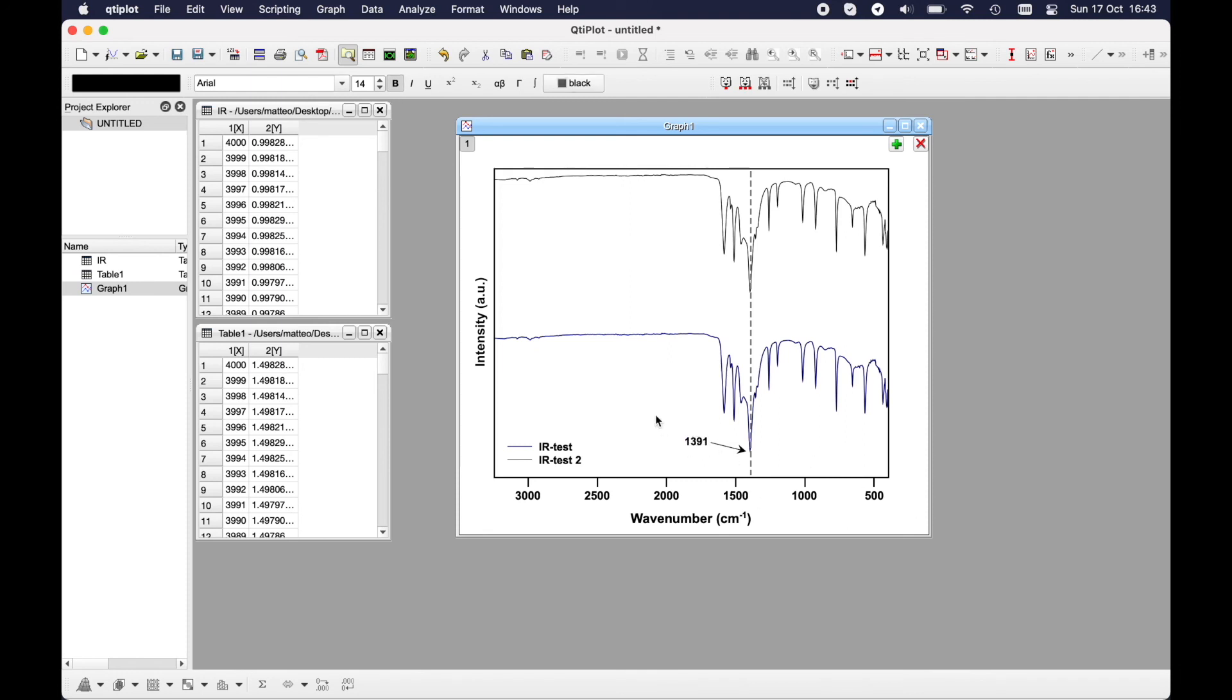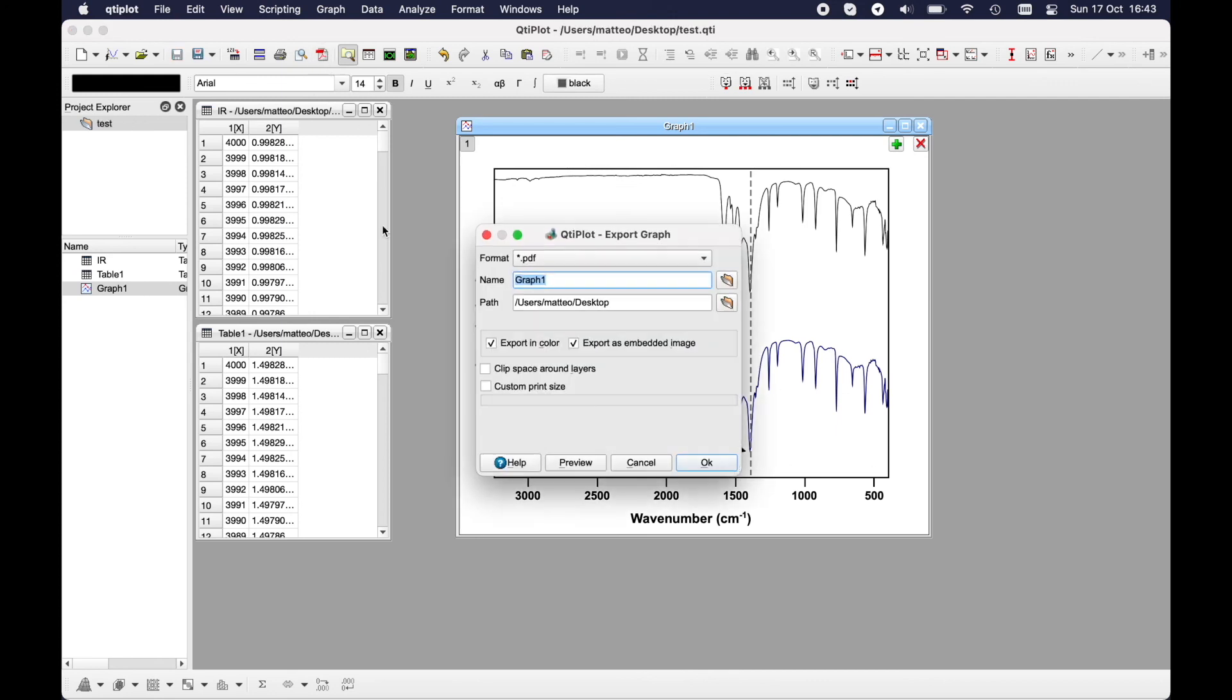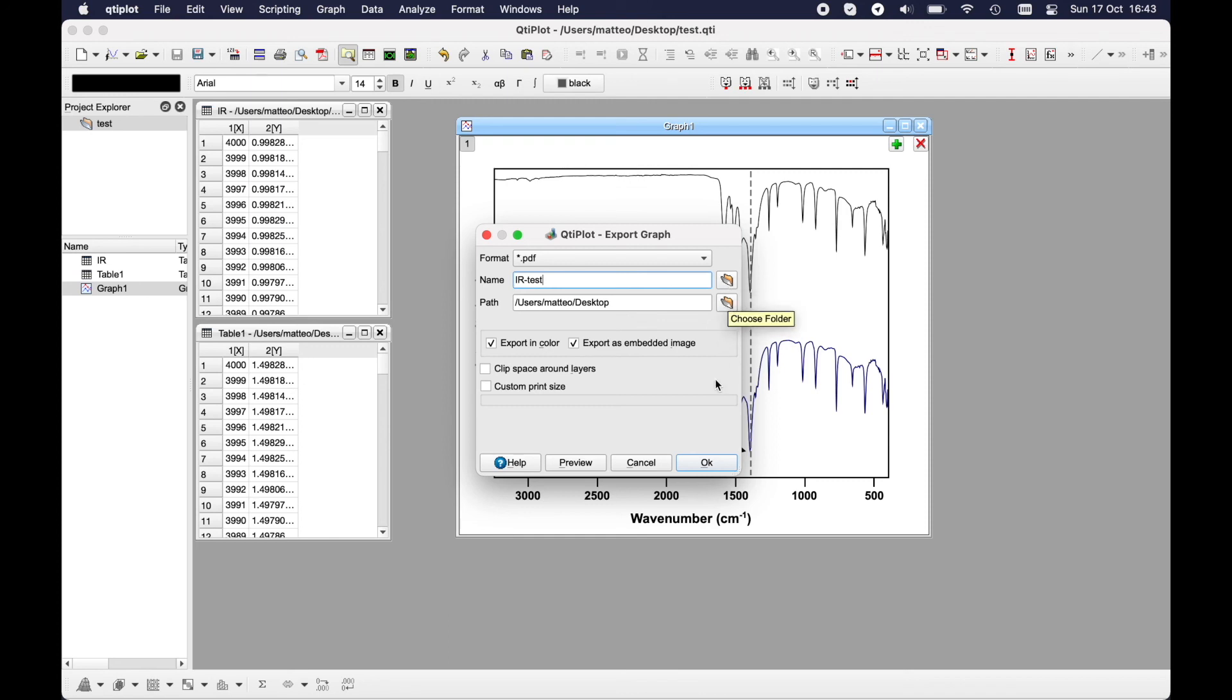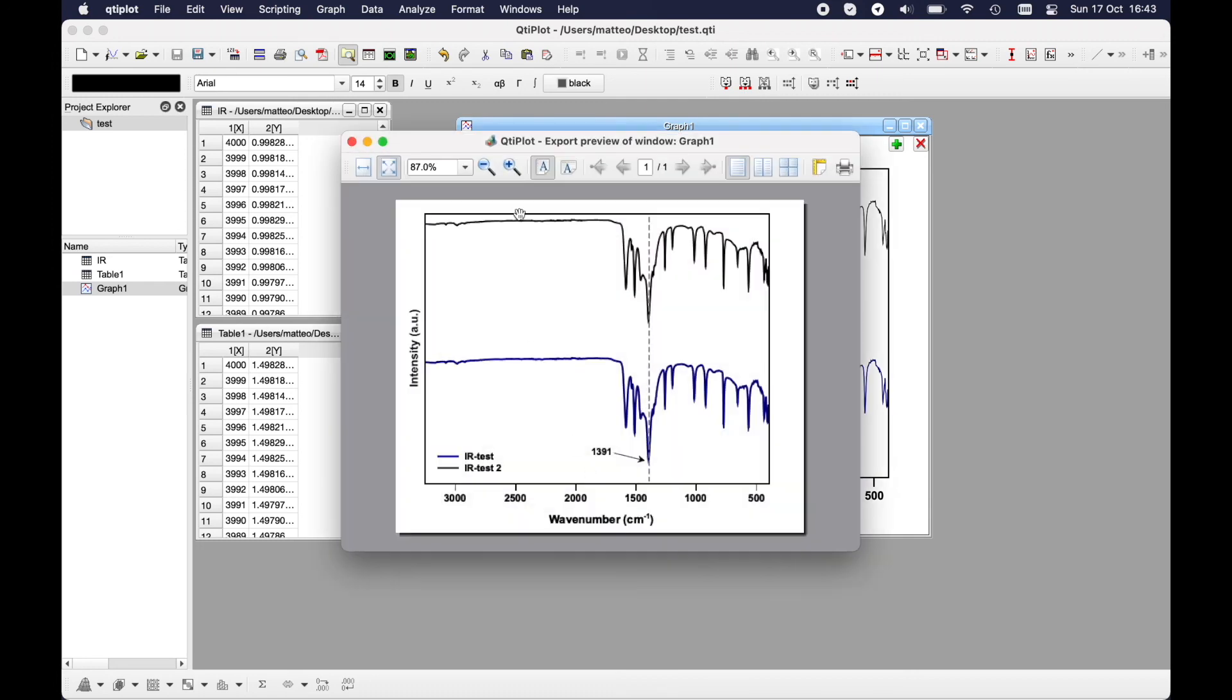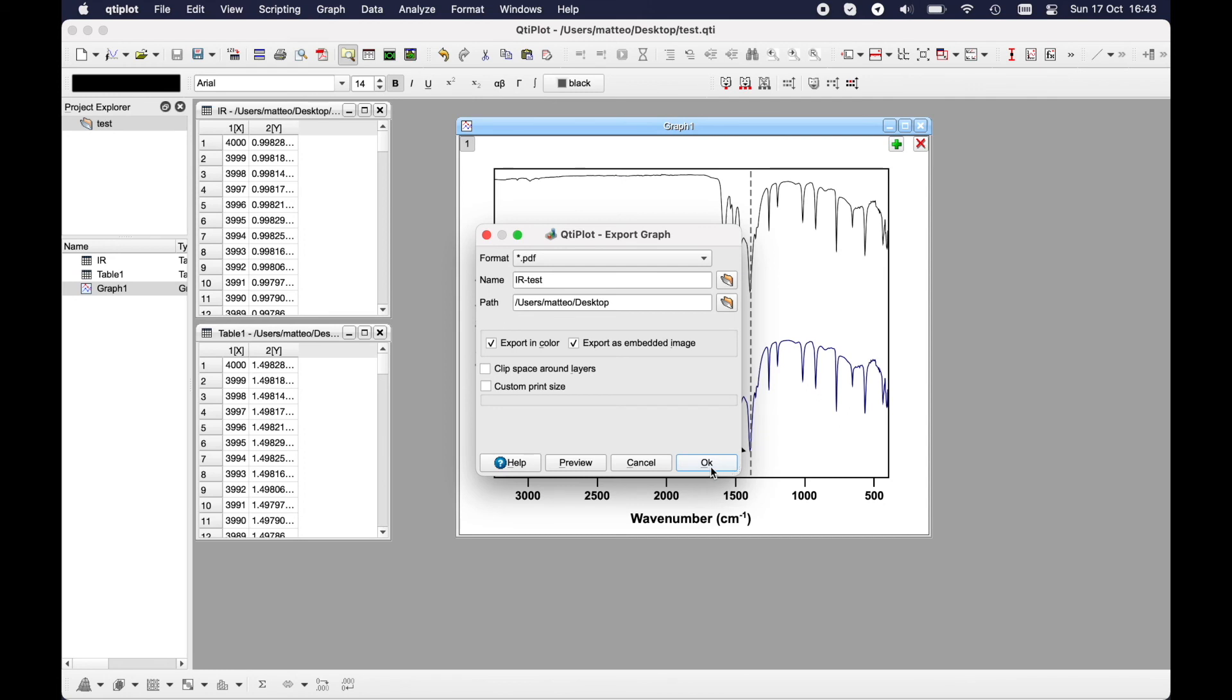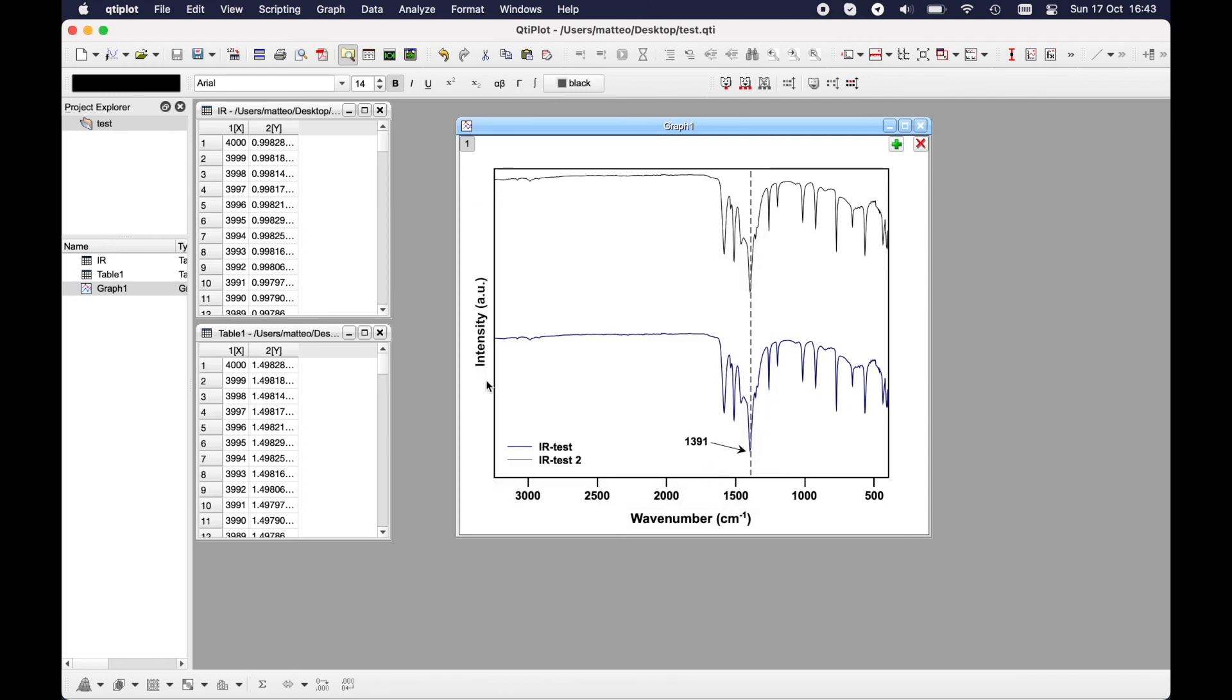Now I would like to export it in PDF. Click here and put the name, let's say IR test for the file. Here I will select the folder and I will export in color and I can have a preview here. So I will export it and that's it.